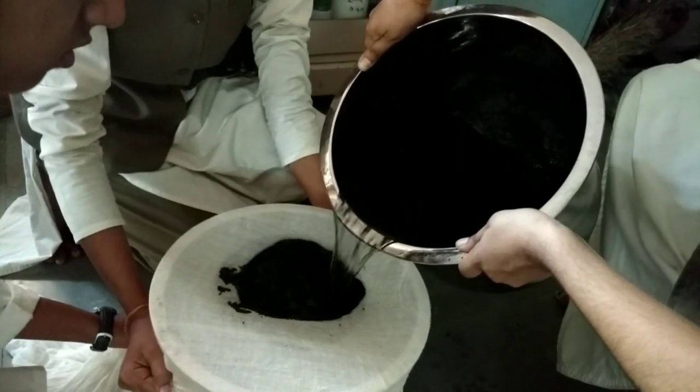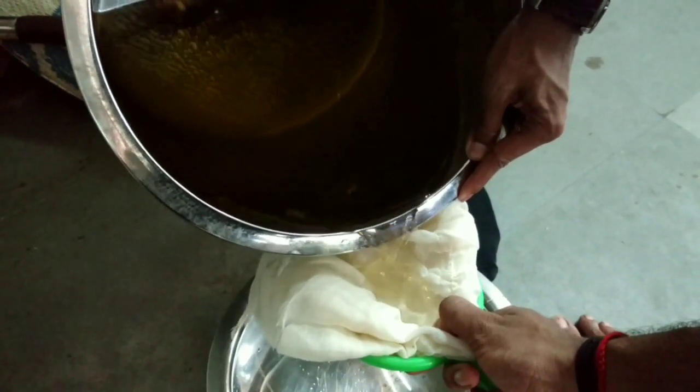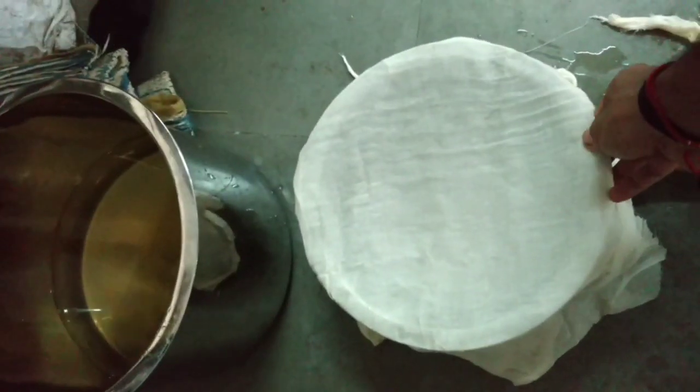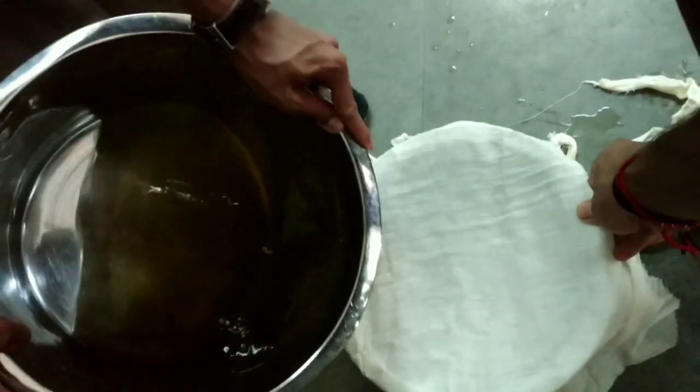The filtrate obtained is kept undisturbed for the sedimentation process. The top layer of water is poured into another vessel, discarding the sediment. This process is repeated 21 times.